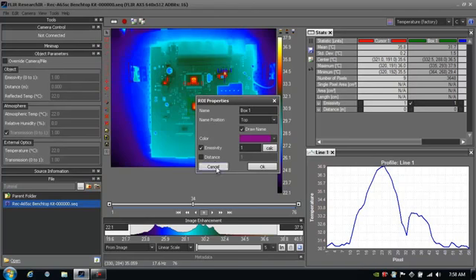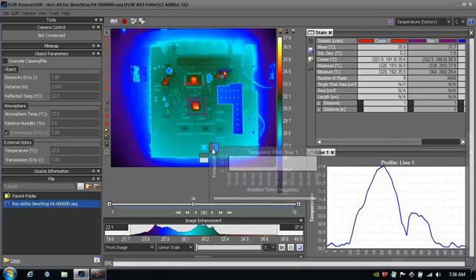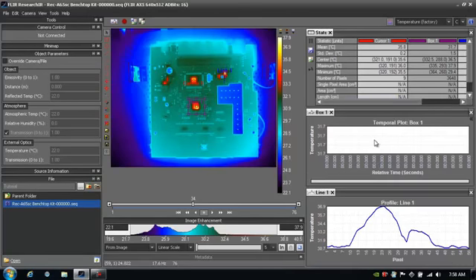Today I'm going to leave everything kind of as the default, so I'll uncheck that, but I do want to change the color so I can see it a little better. Now that we have the box selected, let's do a time versus temperature plot. So I'm going to grab that, and in this case, I'm actually going to dock it below the stats. So now I can have 3 different items here showing up.